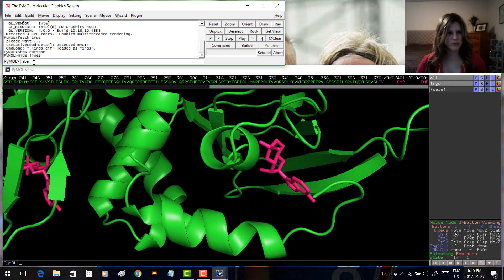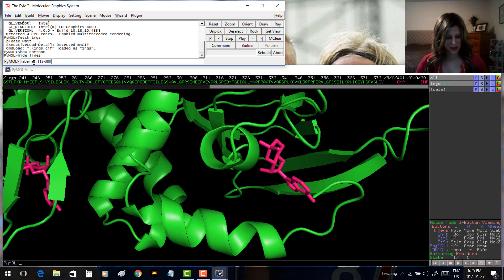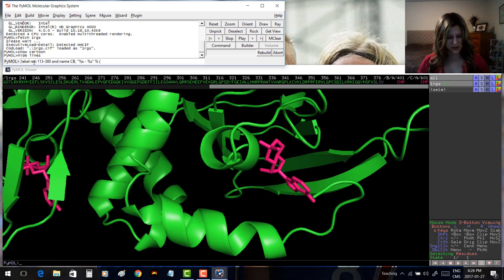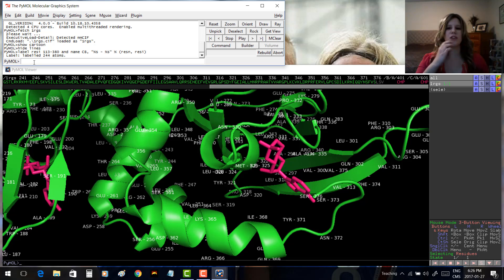Type: 'label resi 113-380, "%s(%s)" % (resn, resi)' and press Enter. That gives us, just like the GUI option under L for Label then Residues, the name and number for each residue in the specified range.